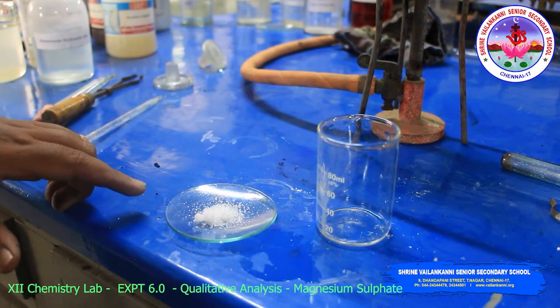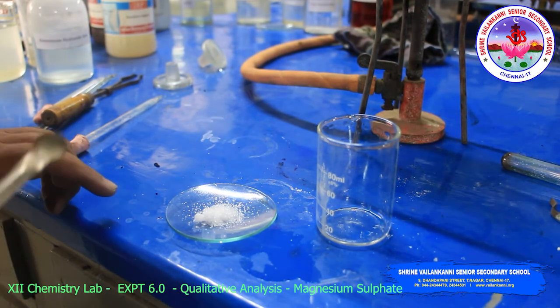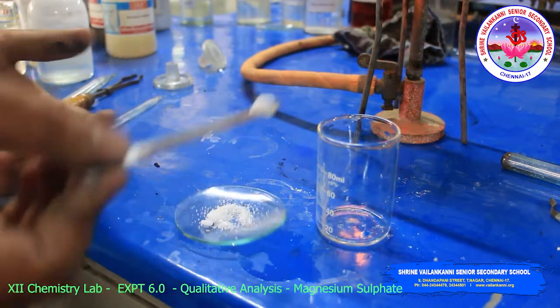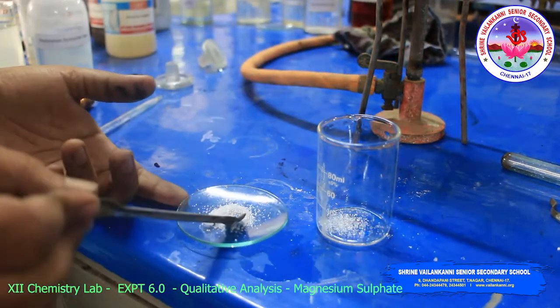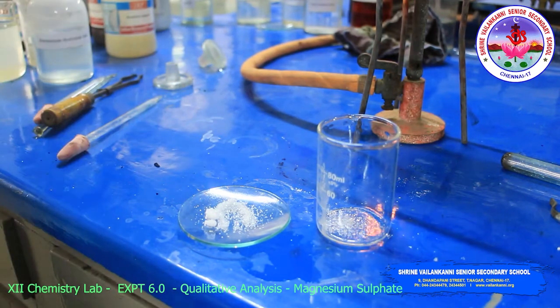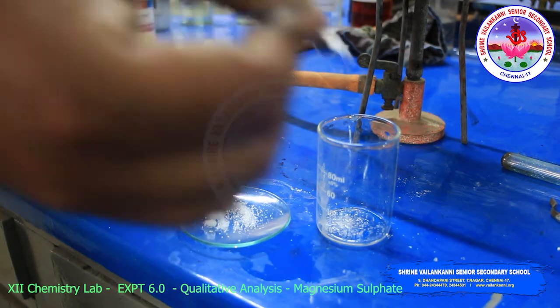Now we will do the experiment. The next substance is magnesium sulfate. So I am going to prepare the extract, the sodium carbonate extract. A small amount of substance is taken, and twice the amount of sodium carbonate is added.